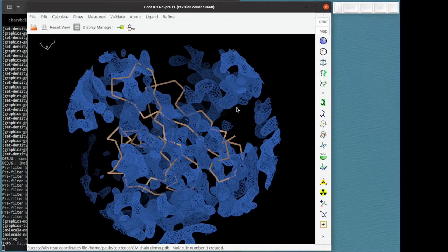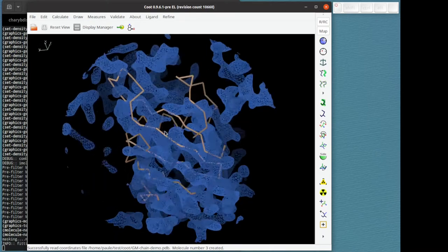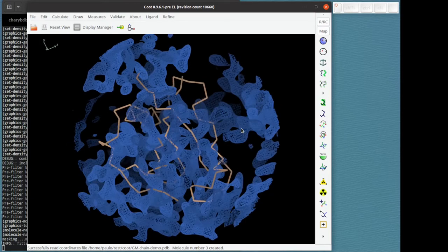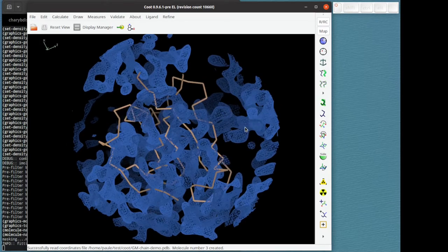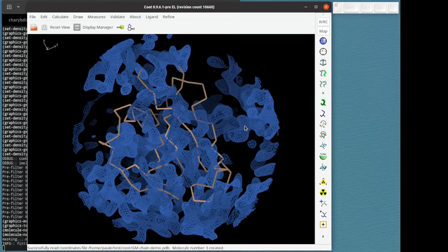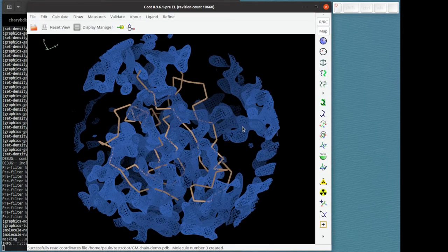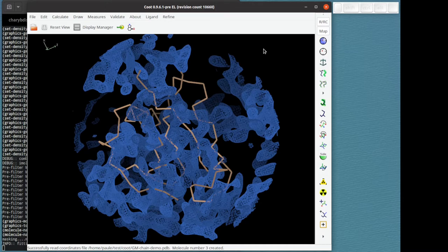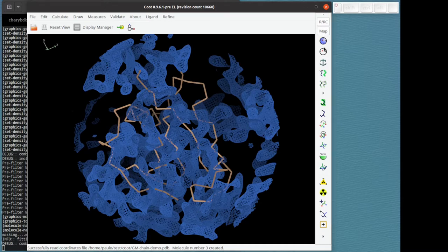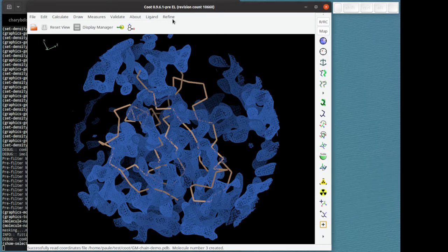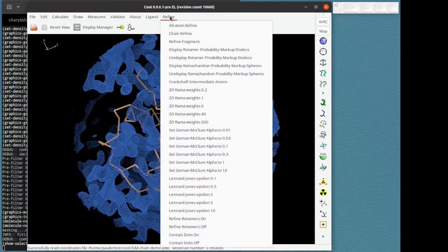But hopefully the Geman-McClure restraints will adjust the refinement so that it does. Let's try refinement without Geman-McClure restraints. So let's go to map, do the normal things, set the weight and then we do refine chain refine.